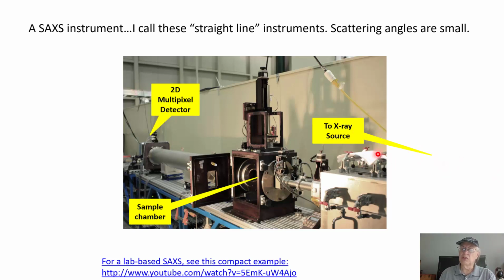The X-rays in this instrument start somewhere off to the right. Don't worry about them. They come out of an X-ray instrument, let's just say that. And there are some slits that give them a defined direction. They just go shooting down this tube, and they would eventually hit the center of that camera, this square thing at the back here. This is a camera, okay? It's just a pixel camera, similar to a CCD in concept, but in design, totally different.